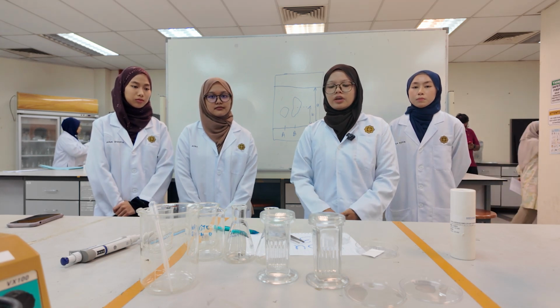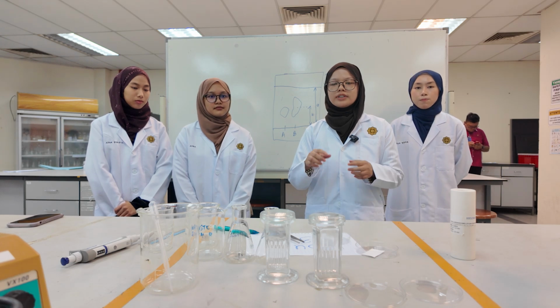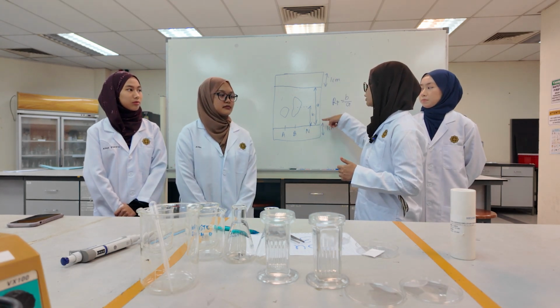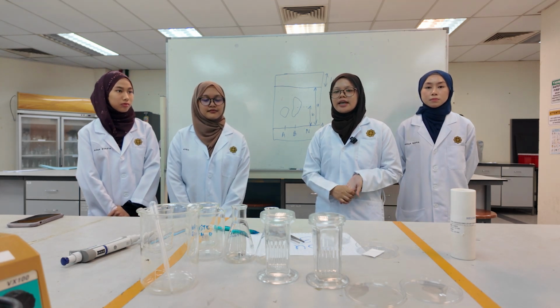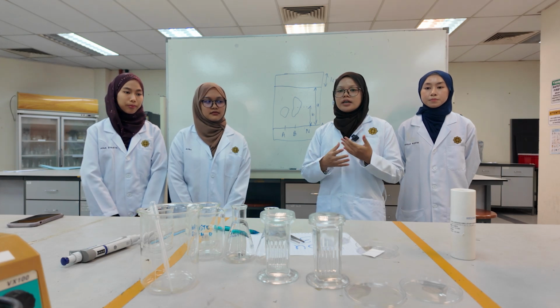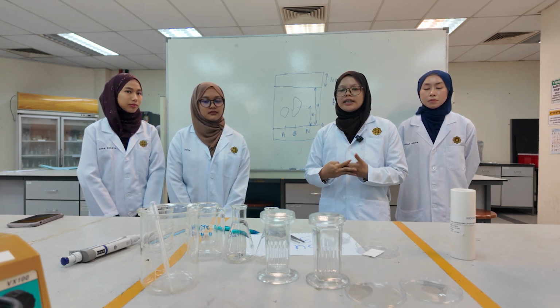We also need to make sure that we don't touch the space between the solvent front and the baseline, because our hands contain impurities that can also interfere with the result of the TLC.